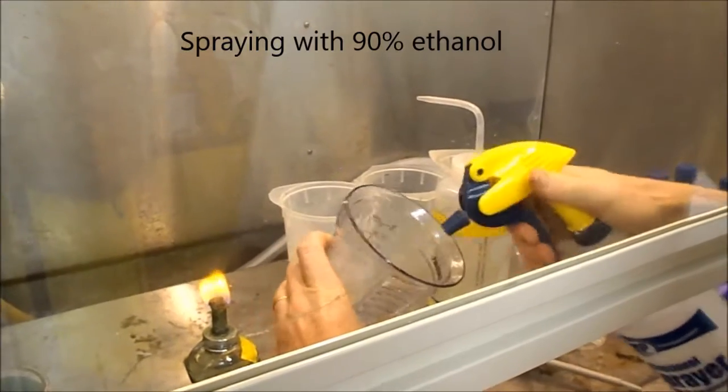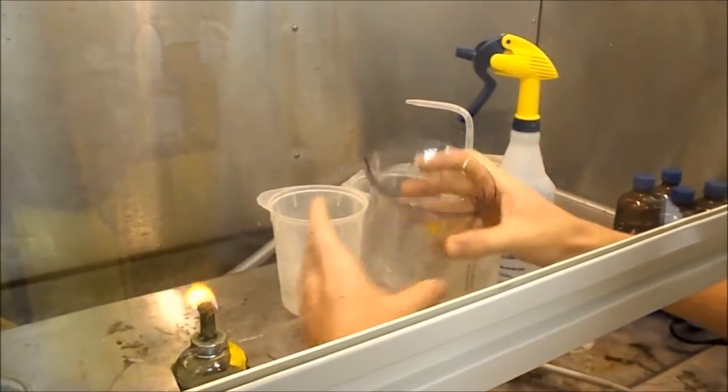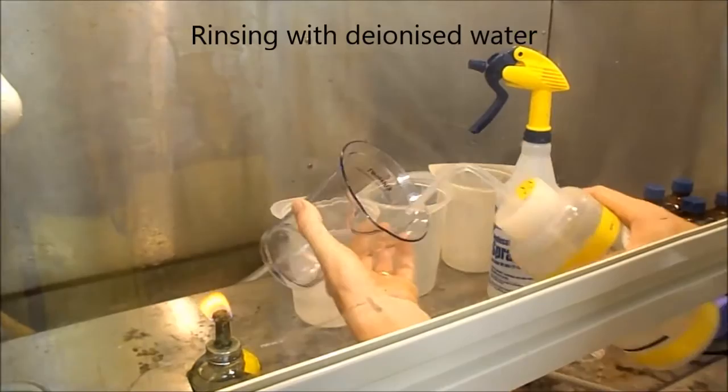That's alcohol, 95? Yeah, about 90. Very good. And DI.